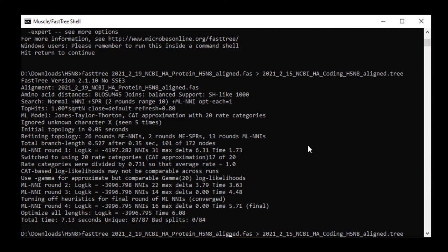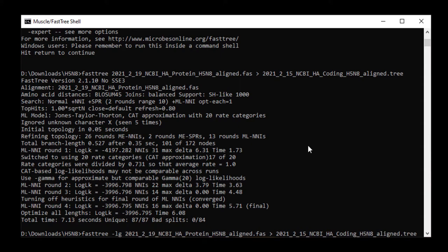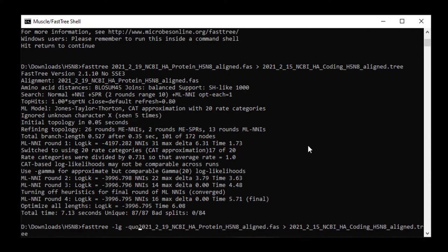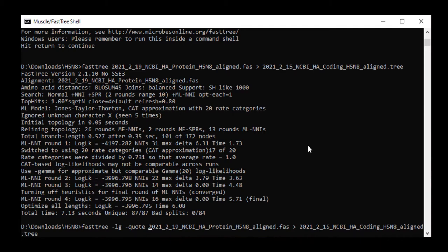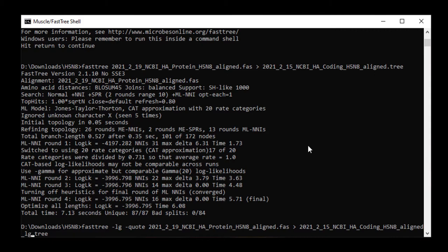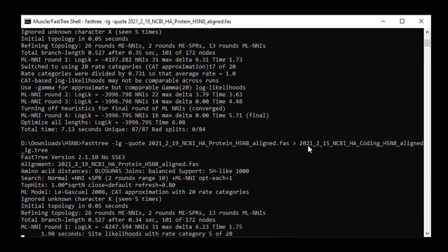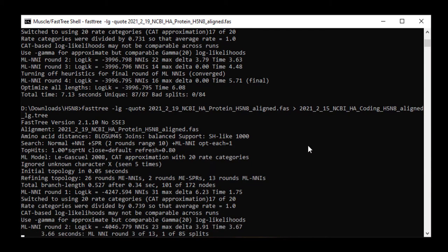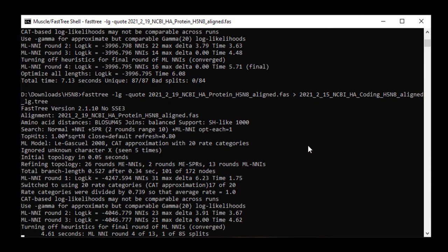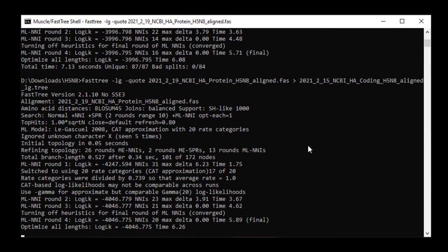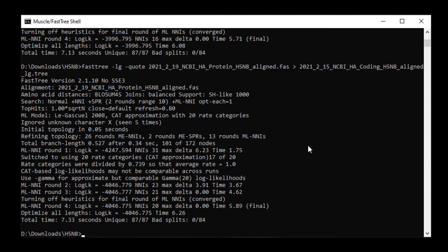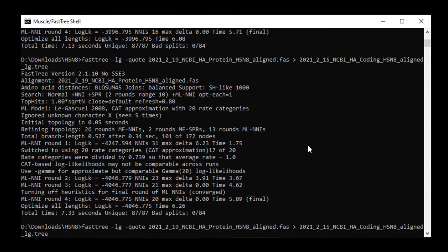Next I changed to using the -lg model and also the -quote function which keeps the names of the sequences in the tree the same as those in the fasta file and doesn't shorten them. You can see that there's a change in the log lk which is the log likelihood of the tree. From the numbers you can't tell if it actually matters. The trees could still look identical and you need to look at them in tree view to know whether there's any significant differences.